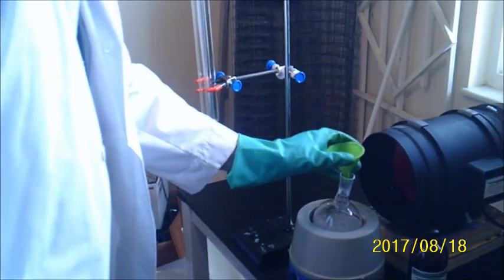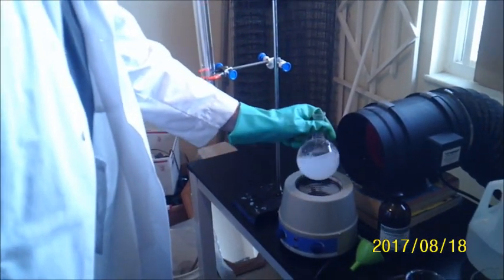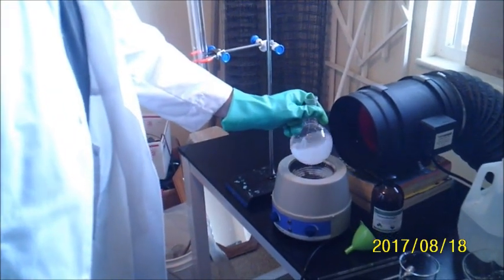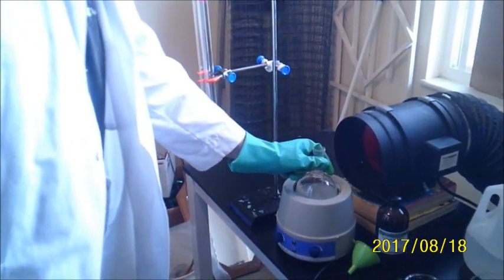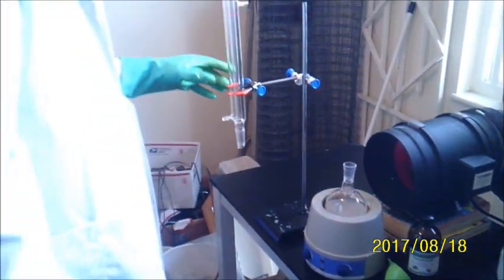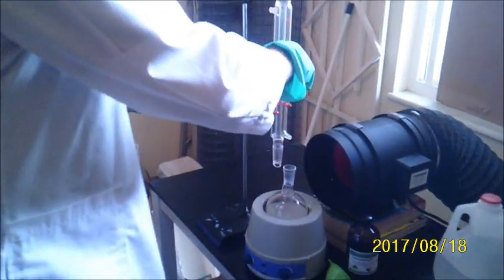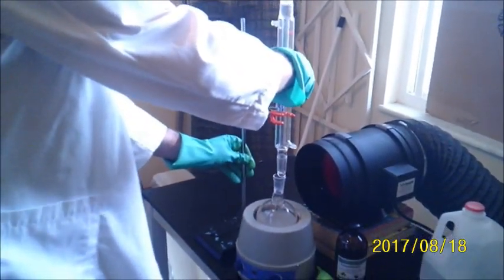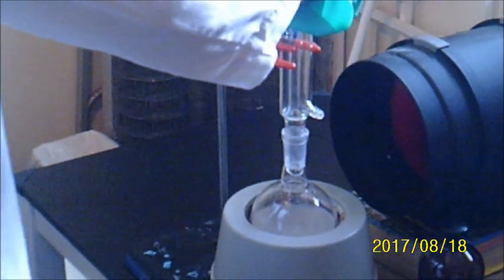Now we're going to swirl the round-bottom flask again to mix up all the ingredients. Now we're going to place the distillation column on top of the round-bottom flask to minimize any formaldehyde vapors which might escape. Of course, we also have the blower fan to vent any formaldehyde fumes which do come off the reaction.